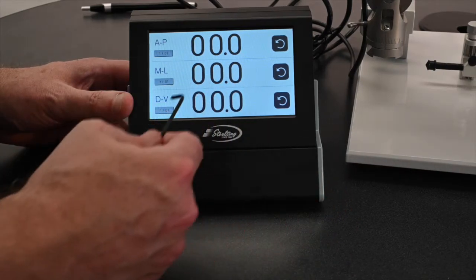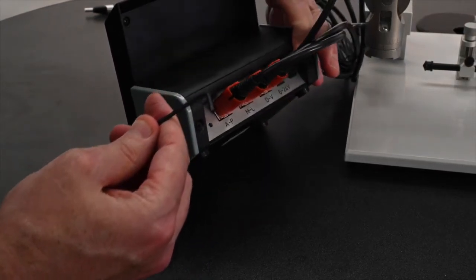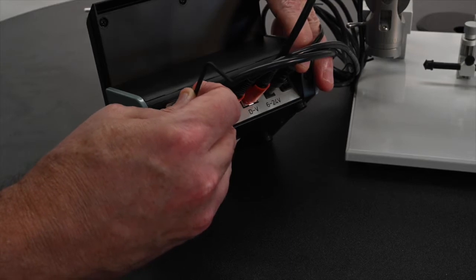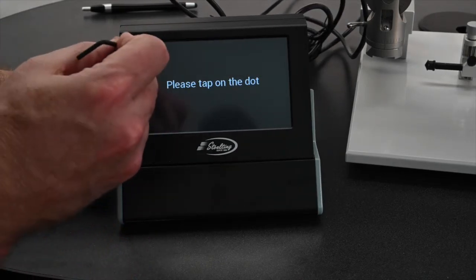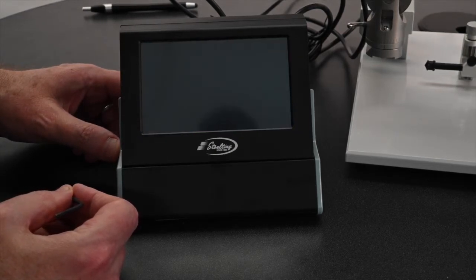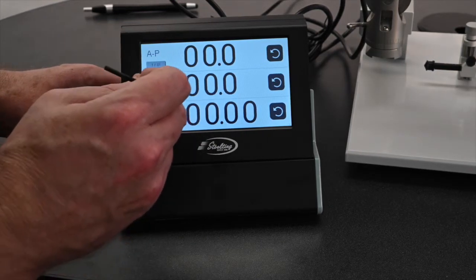If you have any problems with the digital display — meaning it's not responding to a touch — it's very easy to recalibrate it. Simply come to the back, take the Allen key that was included with the stereotaxic instrument, push it into the little port in the back, and hold it for just one or two seconds. You'll get a recalibration screen, and you simply need to tap into the center of each circle. It will ask you to do it a second time, and then it should be perfectly recalibrated and ready to use.